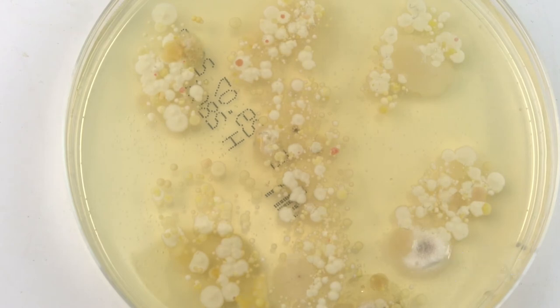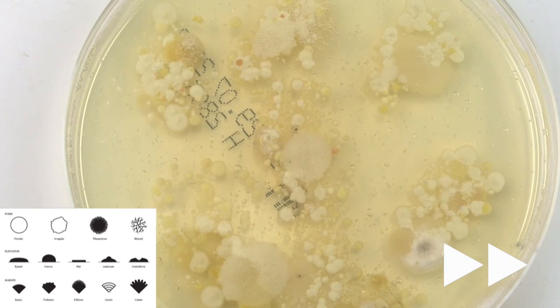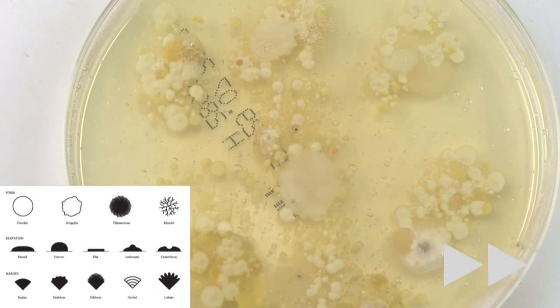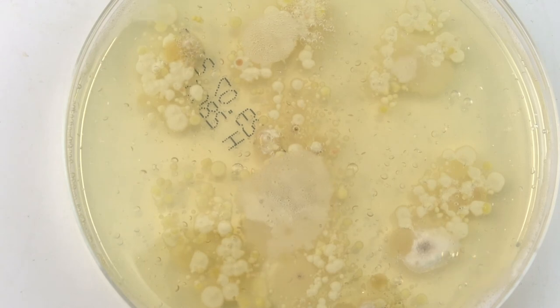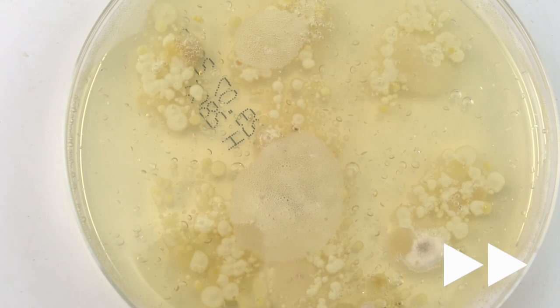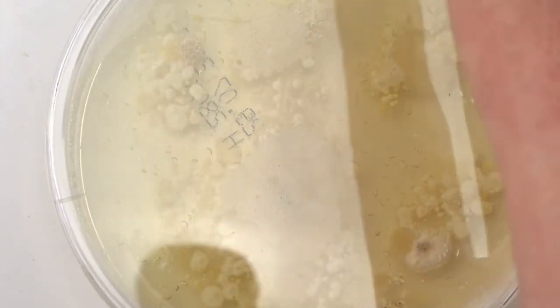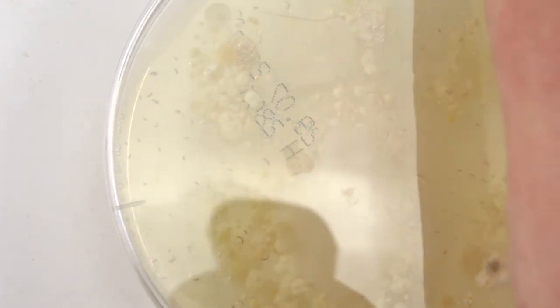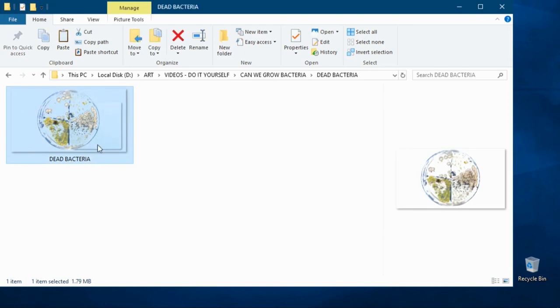I searched a lot on the internet and it's actually quite difficult to identify the bacteria. In order to identify bacteria, their shape, size, structure, color, transparency, and many other factors must be considered. Finally, put the Petri dish into a Ziploc bag and throw it in the recycle bin.